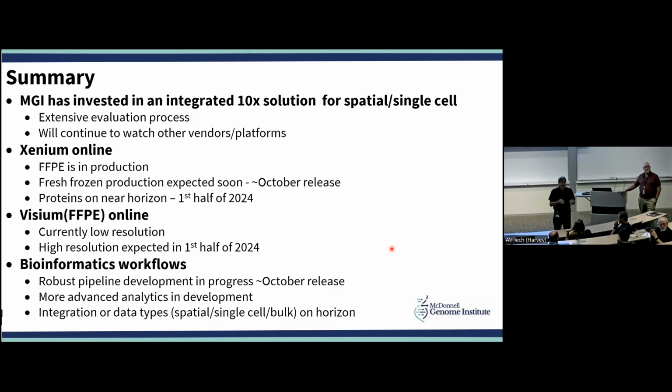Oh, yeah. If you're getting the same types of sections, you obviously wouldn't be able to use the same section, but the same types of sections cut from the same block or whatever, that should be fine. Those were both Visium, but one was Visium, one was Visium HD.